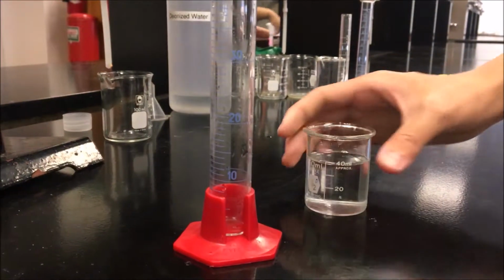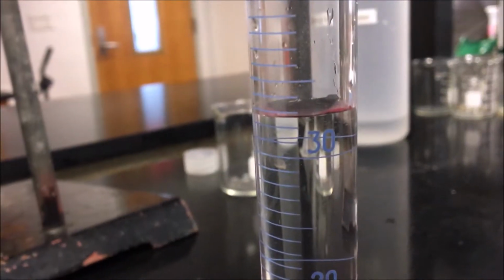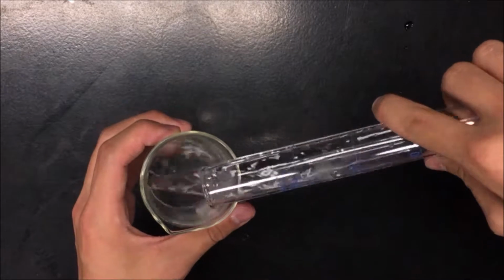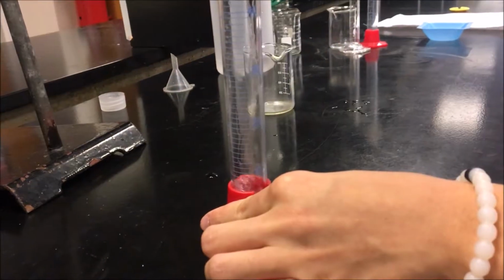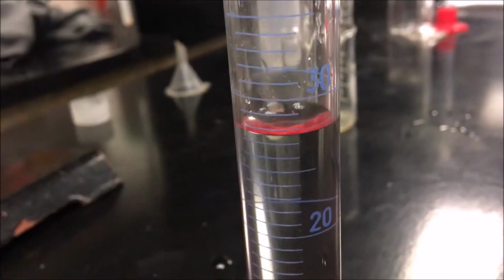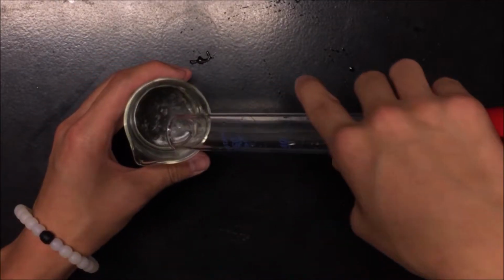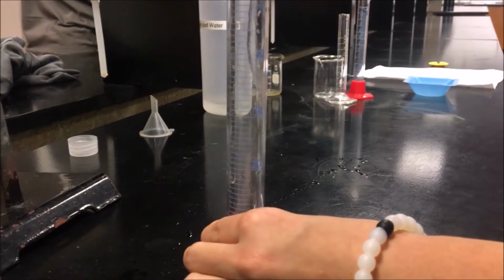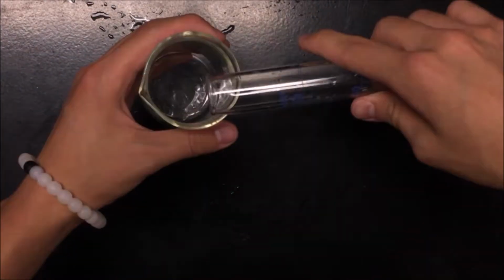There are 7 trials for this experiment. For trial 1, we need 33 milliliters of water and add that to beaker 1. For the second trial, we need 28 milliliters of water. Add that to beaker number 2. For the third trial, we need 24 milliliters of water. Add that to beaker 3.